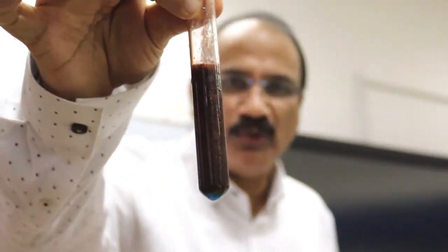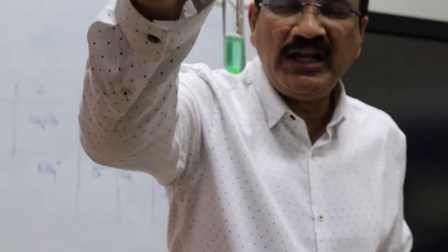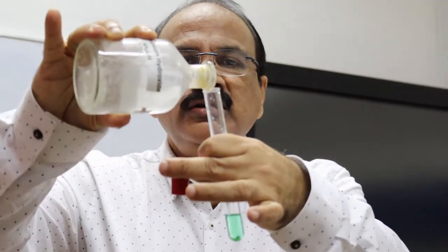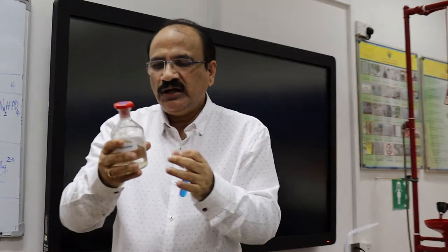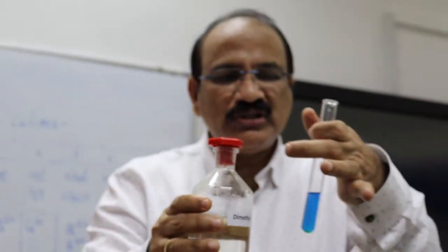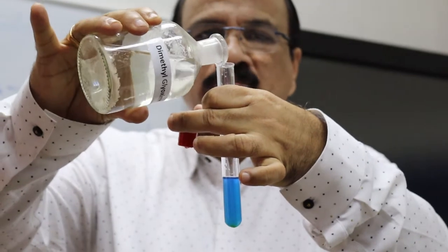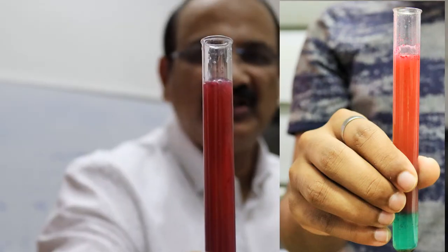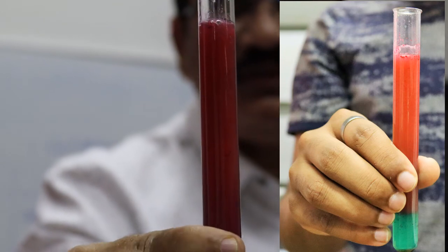For the confirmatory test for Ni2+, we take the nickel salt solution and add a few drops of ammonium hydroxide — a light blue colour appears. Then we add dimethylglyoxime (DMG), which you will also encounter in coordination compounds. We obtain a rose red precipitate, a beautiful colour. This rose red precipitate confirms the presence of Ni2+.